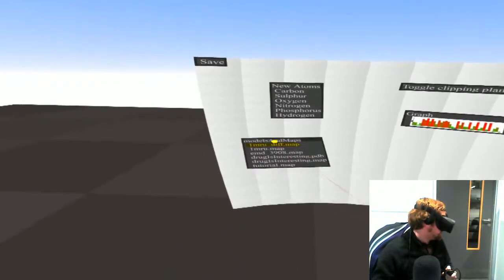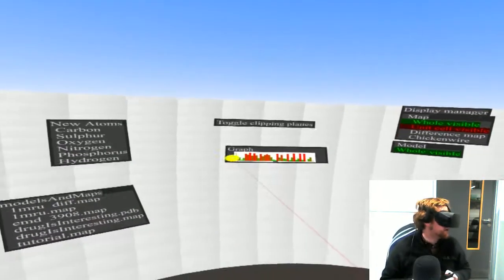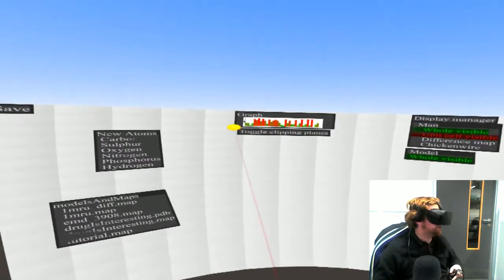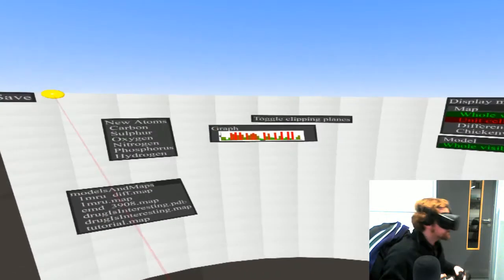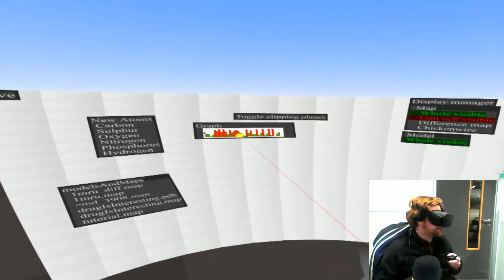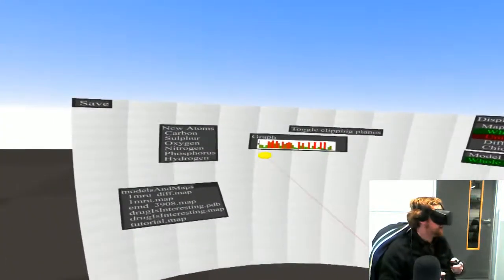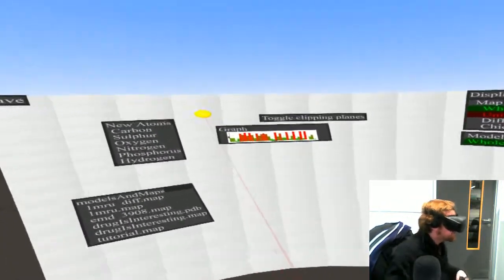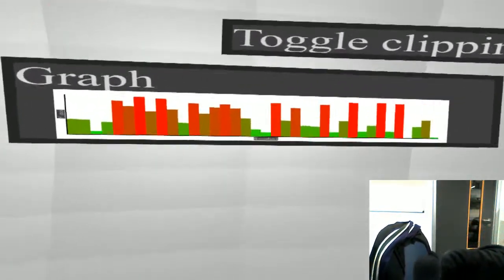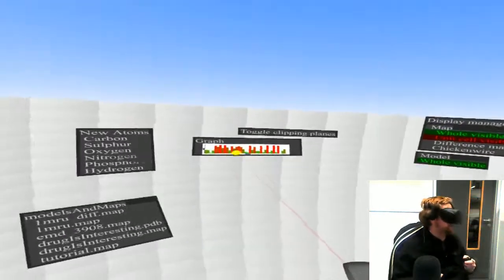Here I've got a file directory, so I can load different data. You want to be able to visualize various metrics that you've got. I definitely need to work on this. It is implemented for you to be able to click on a residue here and it zooms to that particular residue, centering it. But it's not working right now, and the markup is such that I have to look super closely to even read the axes.